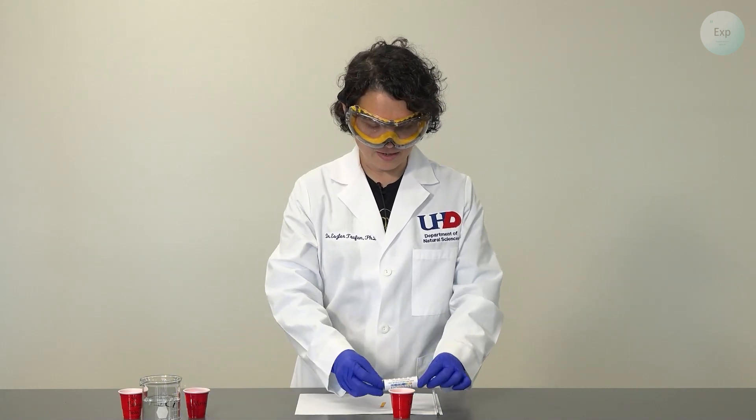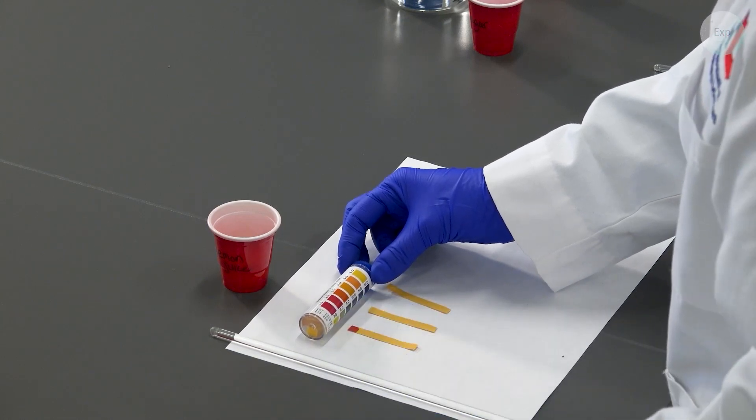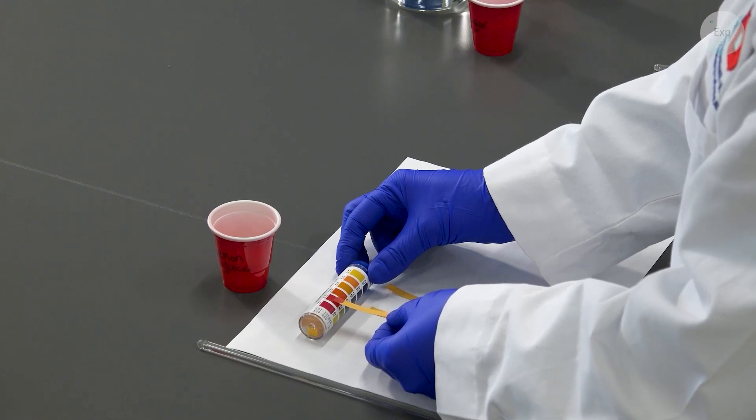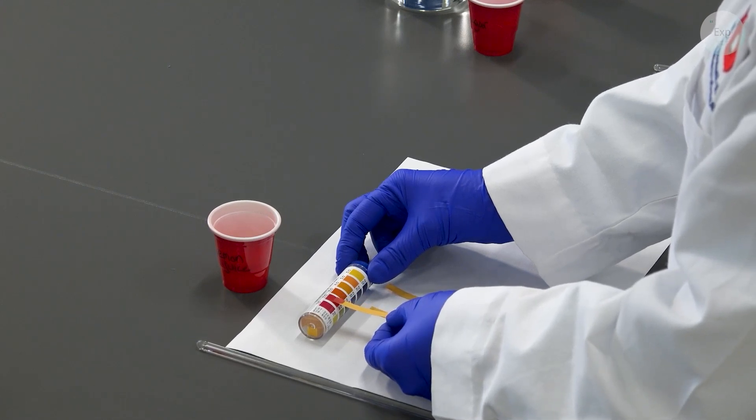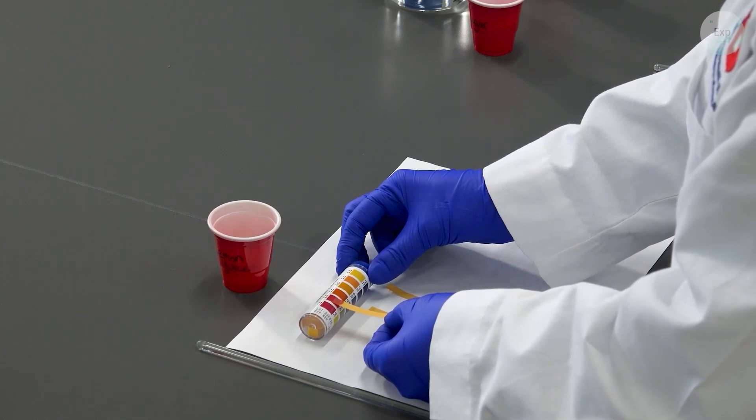And then I can take my pH scale, put it next to it, and I can find which color is most similar to the color response that I got by adding the drop of lemon juice. In this case it appears that the pH of lemon juice is about two.